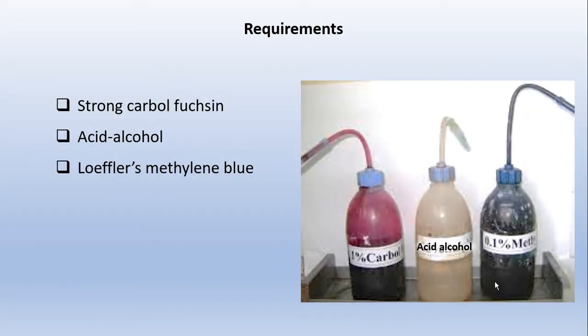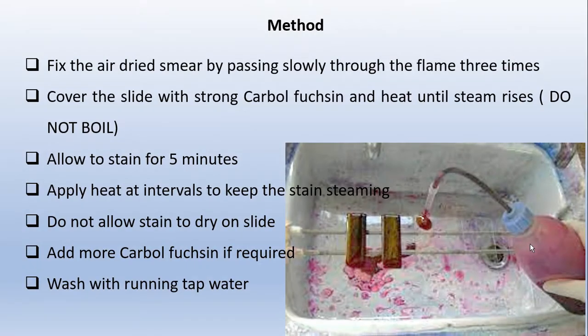The requirements of this staining procedure: we need strong carbol fuchsin, acid alcohol, and methylene blue. Now we will see the method.